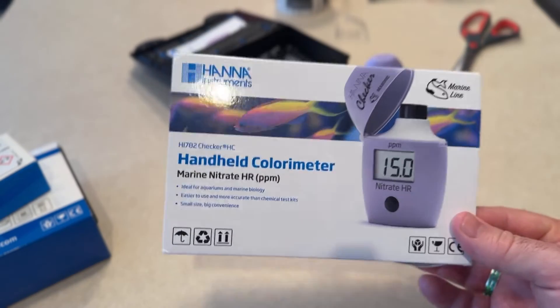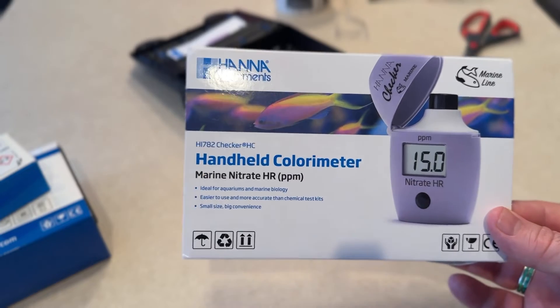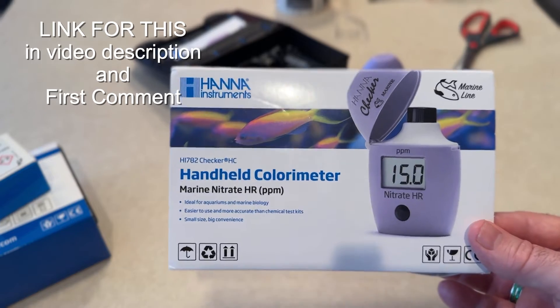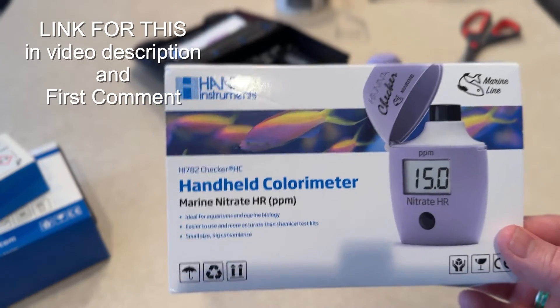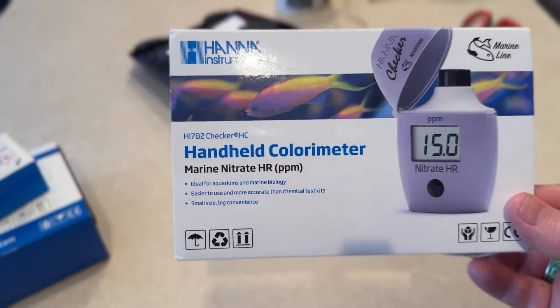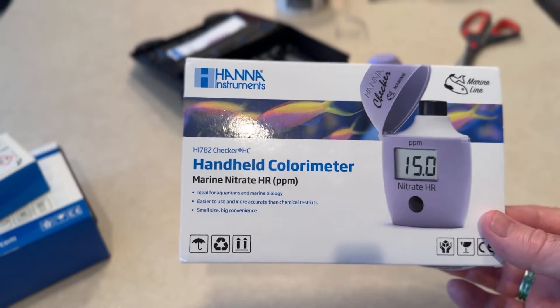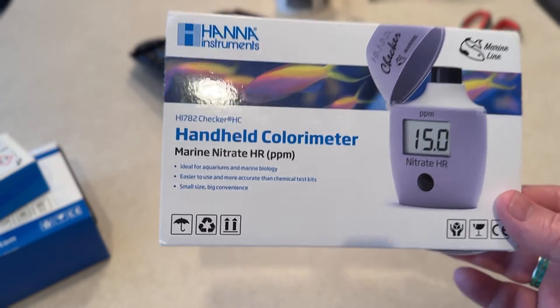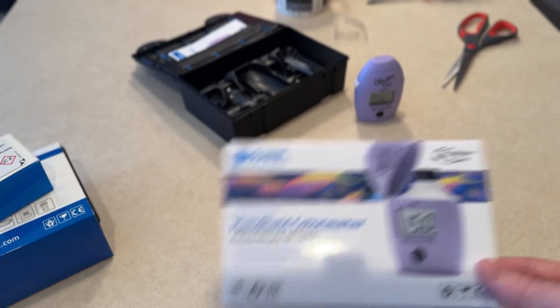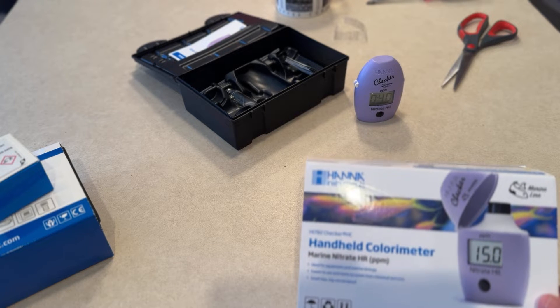They have two kinds of nitrate tests: the high nitrate and the ultra low nitrate test. I don't know why you'd want to test for ultra low, because corals are fine at really low nitrate. I've read that the ultra low nitrate test is not the one to get if you just want to test for regular nitrates in your water. The ultra low is also much more complicated to use — it was nothing like this whatsoever. This was simple, easy, kind of fun.